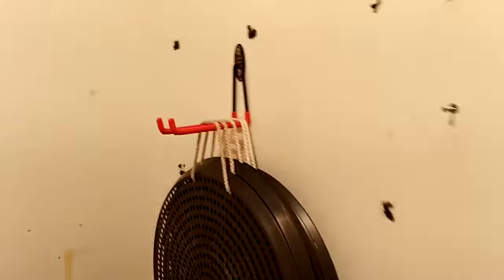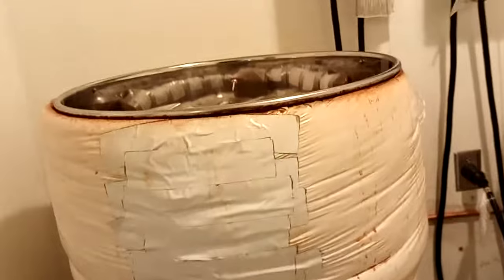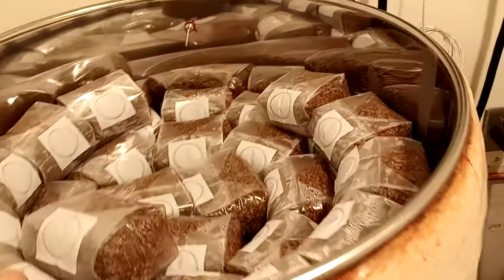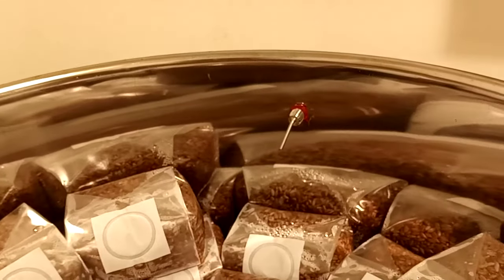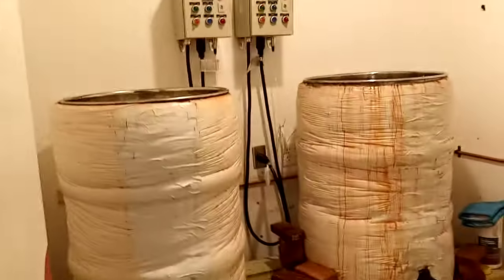You can see this is where we hang our perforated sheets. A little more detail on those — I picked these up on eBay. If you've got a place locally that's probably much better than paying the shipping, but I got a real good deal on eBay because I bought quite a few at once, and the gentleman that sold them worked something out with me since you could ship the smaller ones inside the bigger ones.